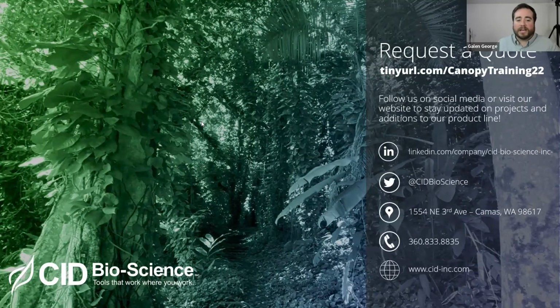With the post-measurement data processing, it's actually nice with hemispherical photography to have all of your raw data and be able to, if need be, have access to that. It's all about data transparency, as opposed to an instrument that just provides a readout of results, and you just have to trust it and take it for its word. It might be a little extra work, but you have access to all that raw data. That is also a very big advantage of hemispherical photography.